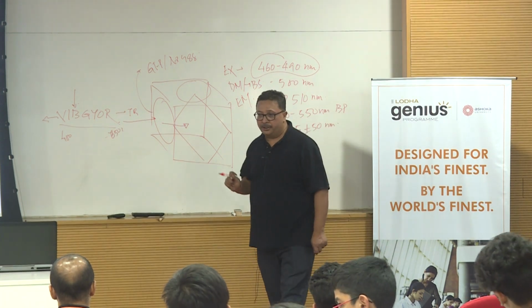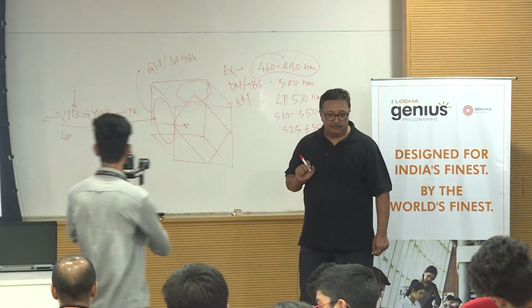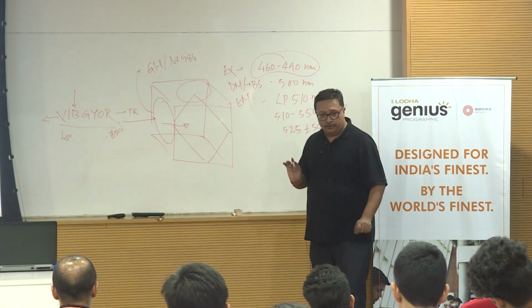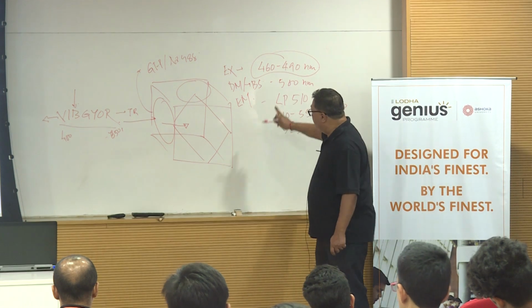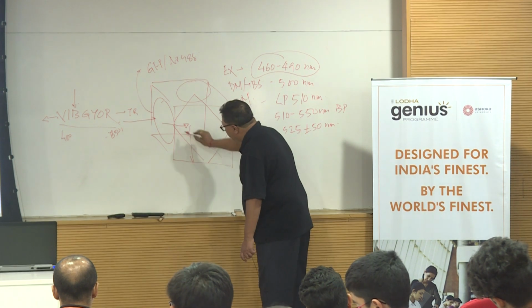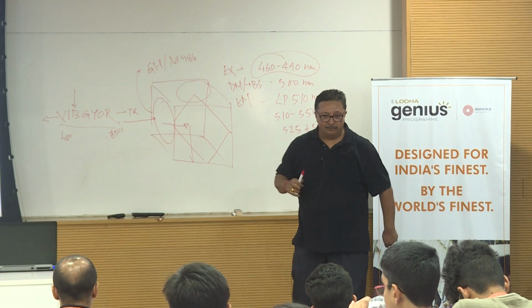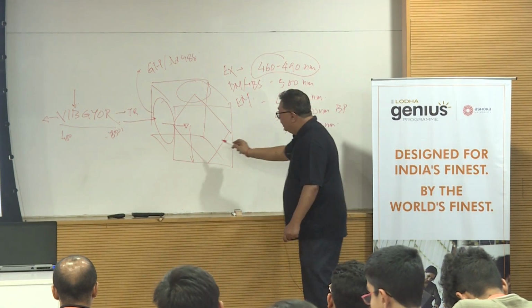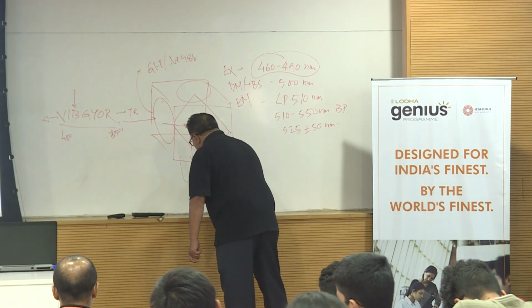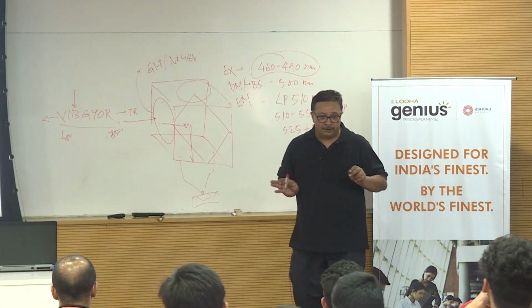So the functionality of this dichroic is like a beam splitter. It splits the wavelength into two components: one lower than this value and one higher than this value, simple. Lower than this value means the same blue light. Your dichroic is inclined at 45 degrees, which means the light will go 90 degrees below. So whatever light came in goes 90 degrees to the objective and then you have your sample. That is how you have seen a fluorescence microscope.